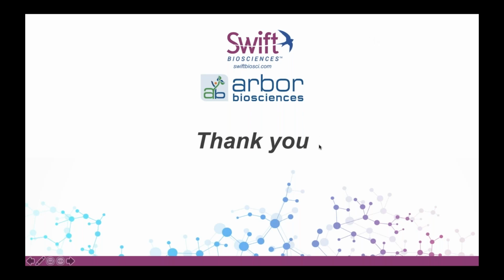Yeah, so for ribosomal depletion, I've performed experiments doing that non-targeted workflow where you do ribosomal depletion with the library and then sequence. And you really only see a 10-fold increase in the amount of data that you get. So previously, when you had 0.01% of your reads coming back SARS-CoV-2, the ribodepletion made it 0.1%.